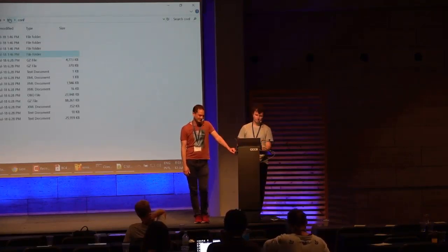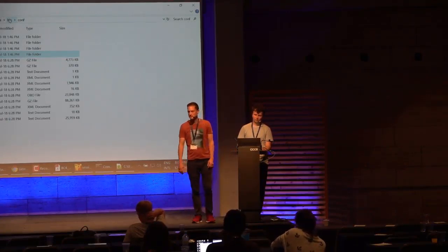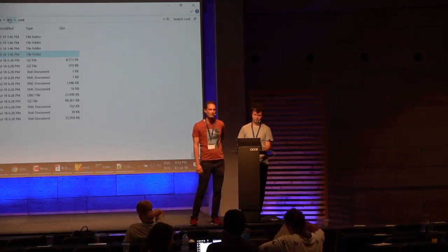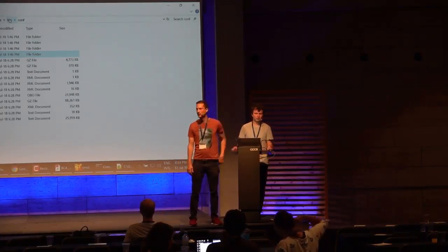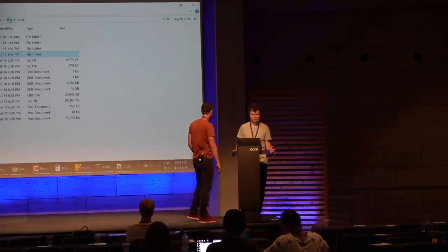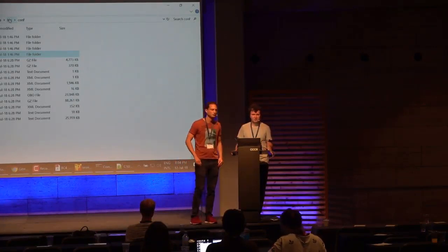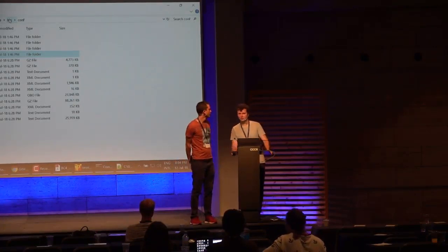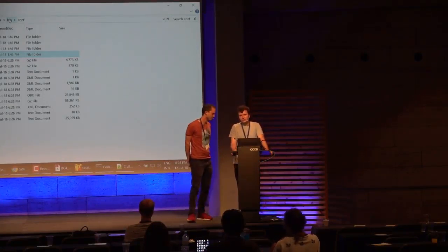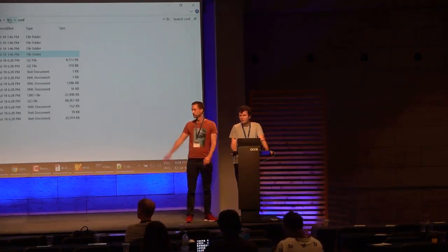Maybe they could switch it on if they have a reproducible error, because the message you wrote here, for example, to yourself, is hard to reproduce from. No, I mean, you just provide a Perseus session and a print screen or just this message together. I think it's enough. I mean, we should definitely consider that. I don't think it would be harmful. Yeah, thanks. Okay, thanks.